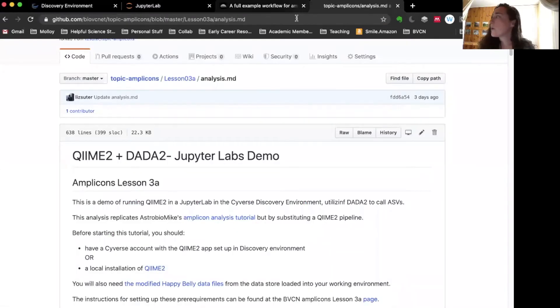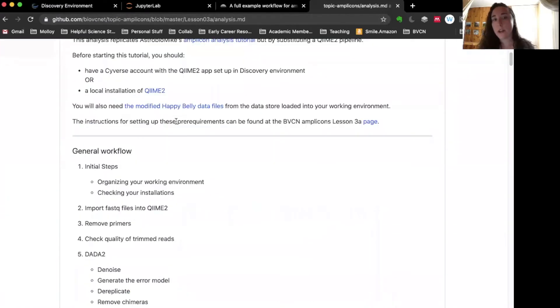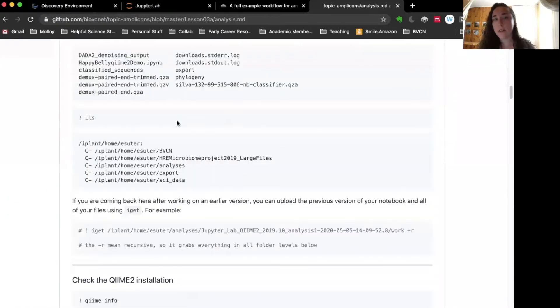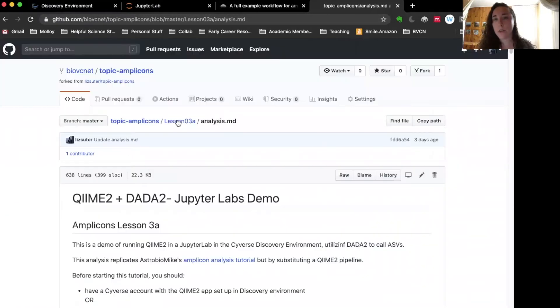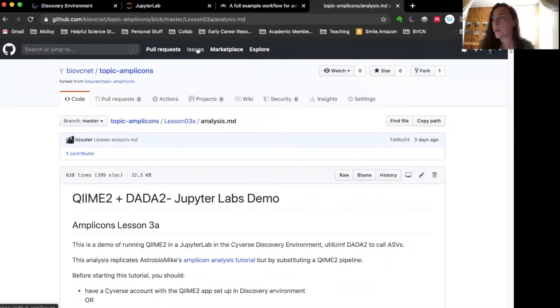This lesson is based on an existing tutorial from Happy Belly Bioinformatics that uses DADA2 and implements that in R in order to draw ASVs from a dataset. We're using the same dataset here, we're going to try to implement the same parameters, and we're going to use DADA2 but it's going to be implemented in QIIME 2 instead of directly in R.